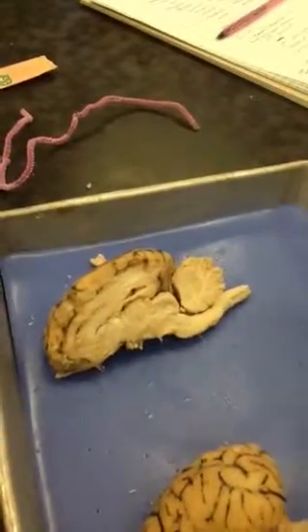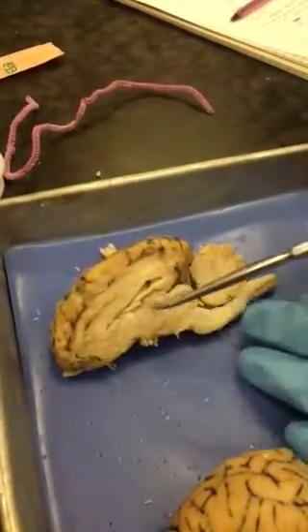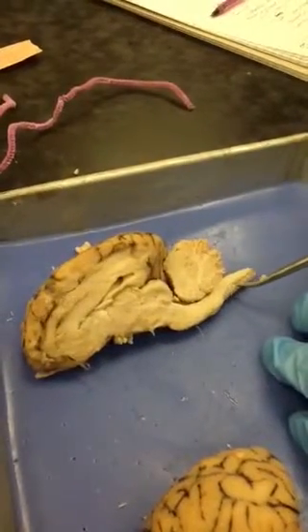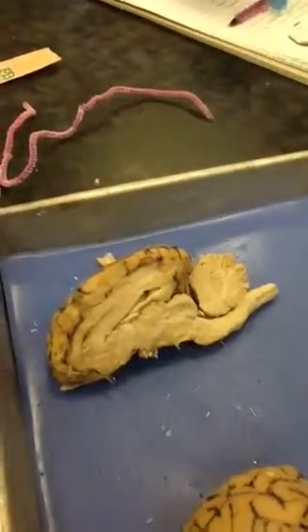This is the inside of the brain. Here we have the lateral ventricles, and then here it leads to the third ventricle, and then to the fourth ventricle, and then finally it goes to the central canal, which goes to the spinal cord. Okay, after that, what do you have next?